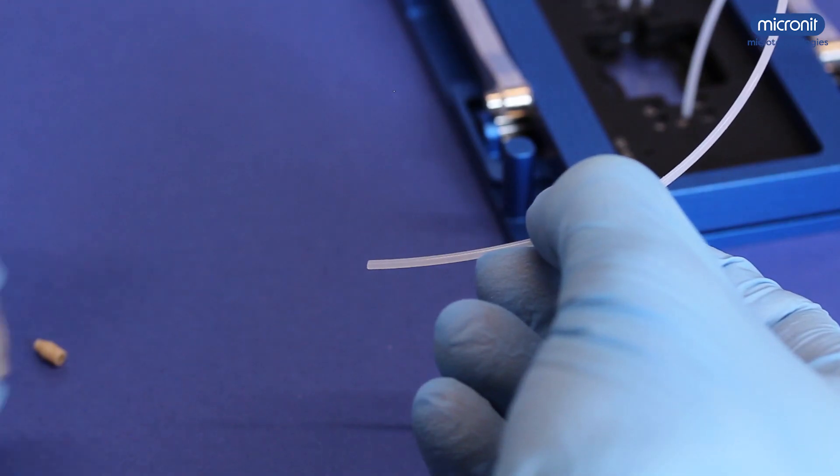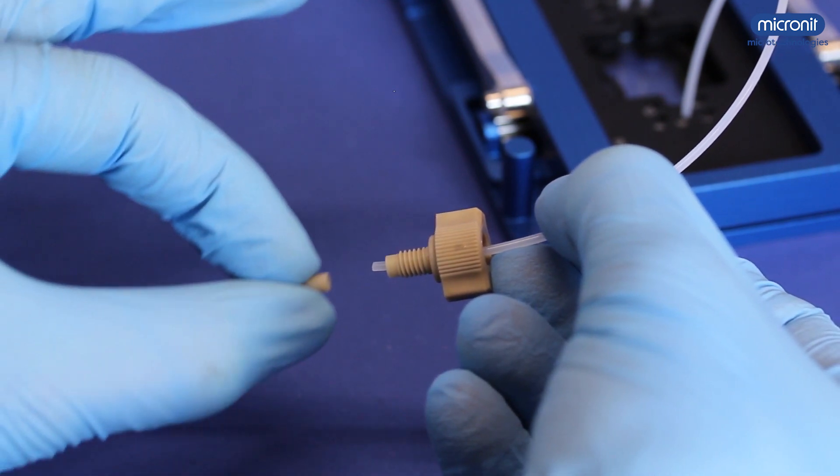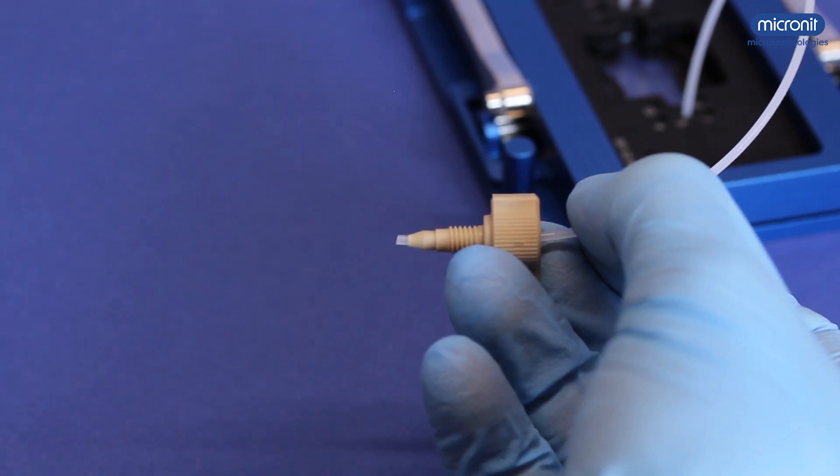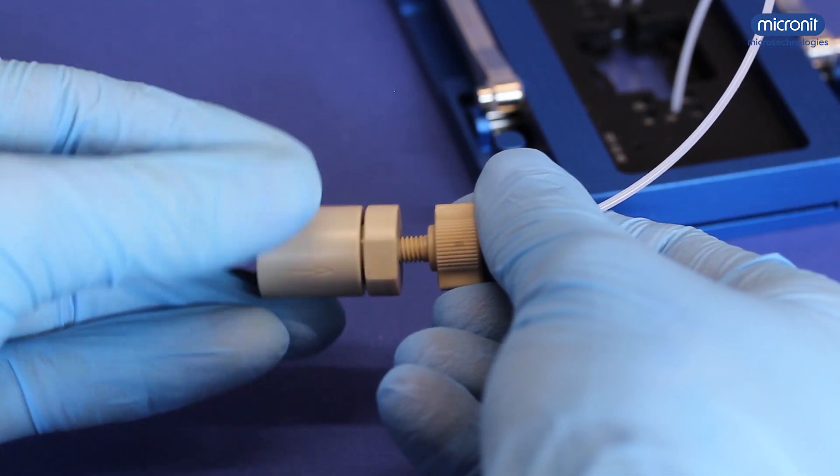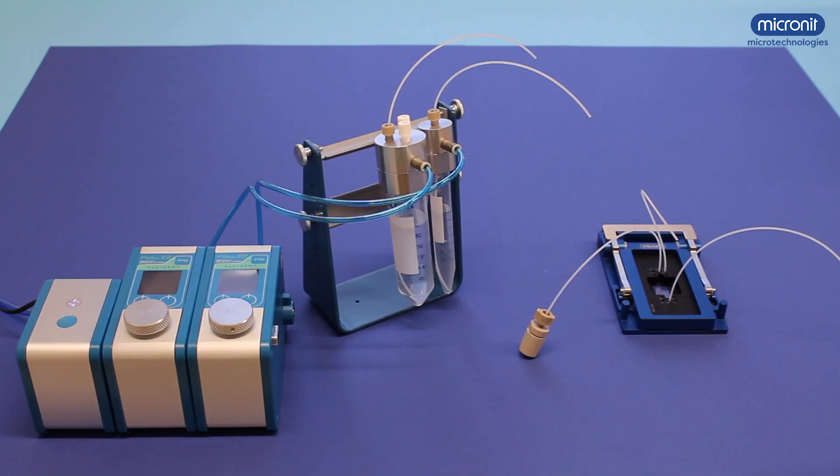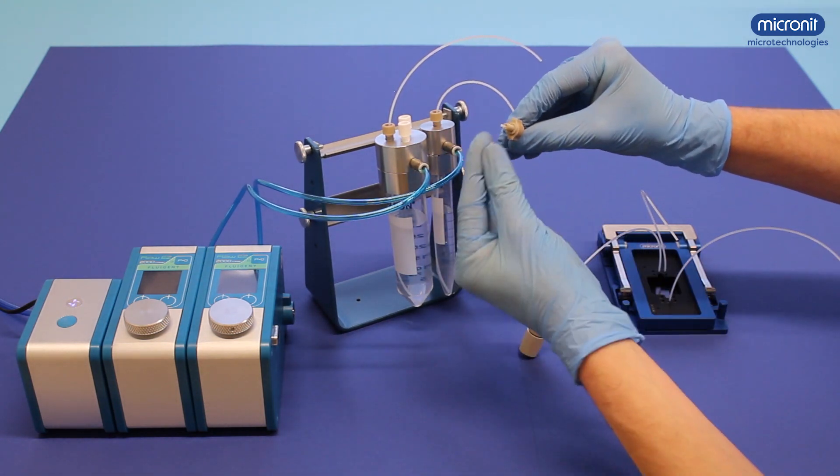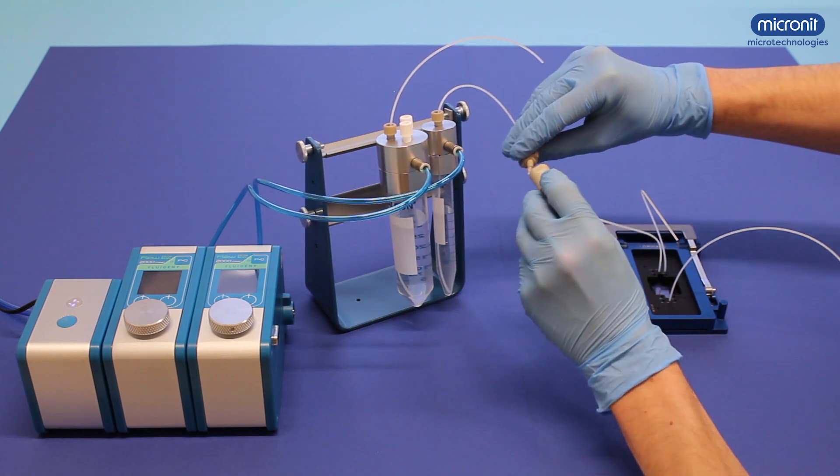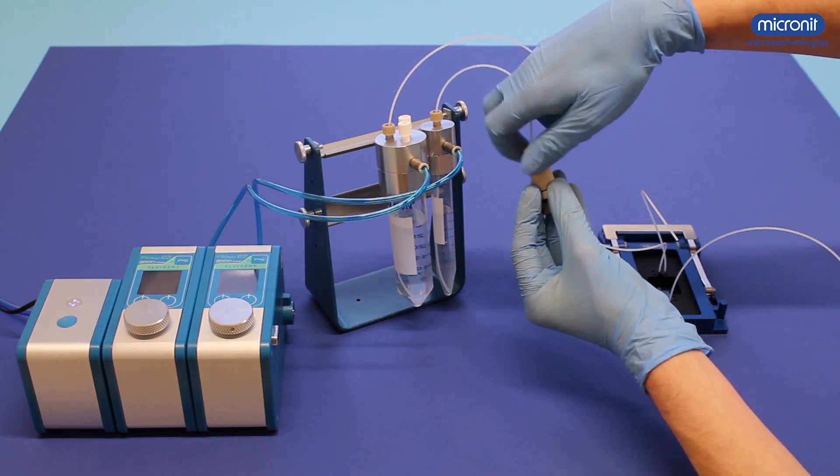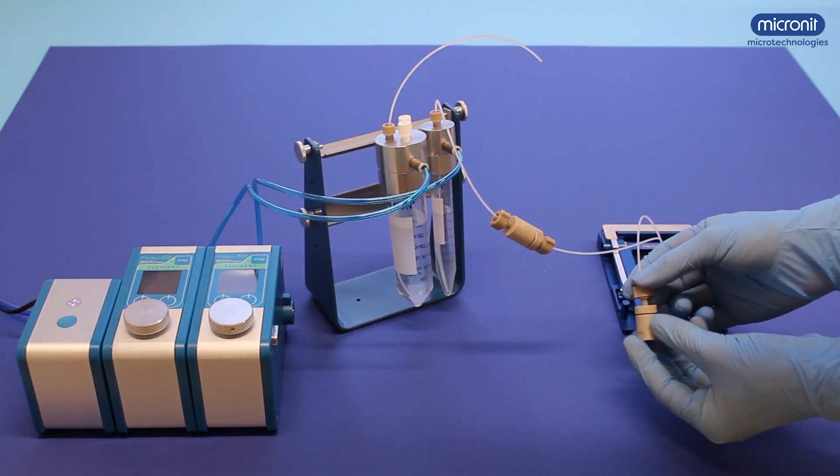To connect the filters to the tubing, string these parts on it. Screw the filter on it, with the arrow pointing in the direction of the flow. The same components can be used to connect the filter to the rest of the setup. And the same can be done for the other channel.